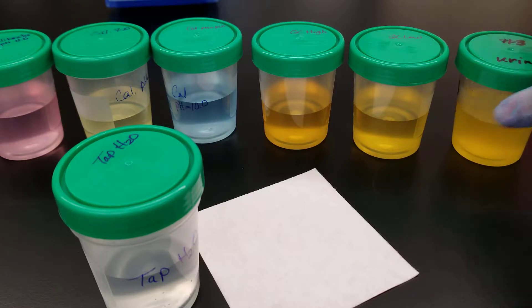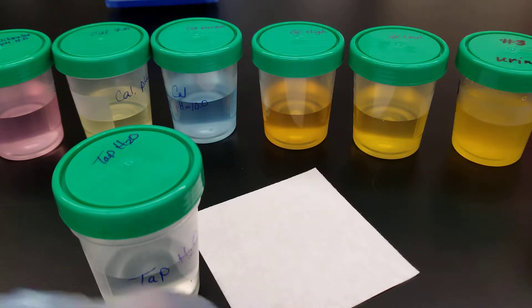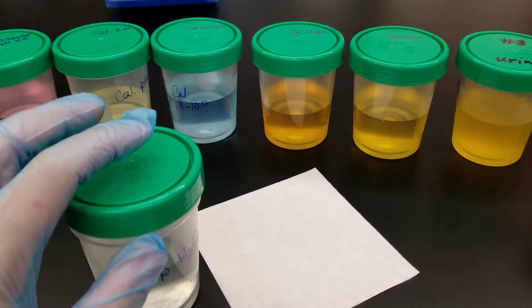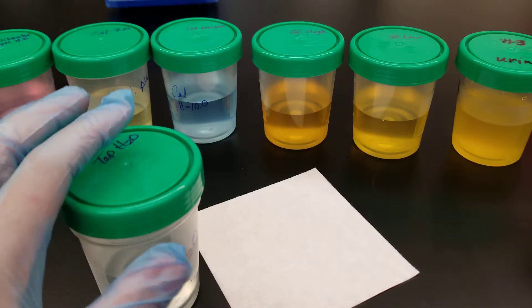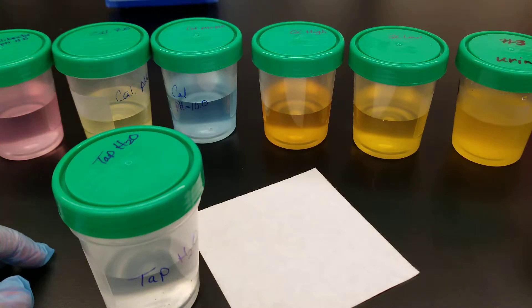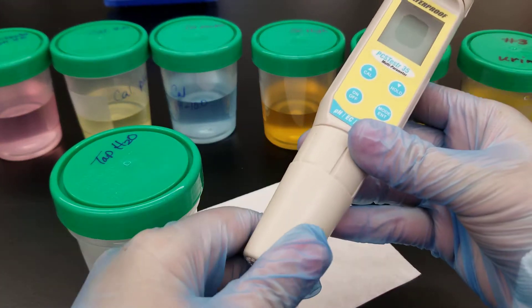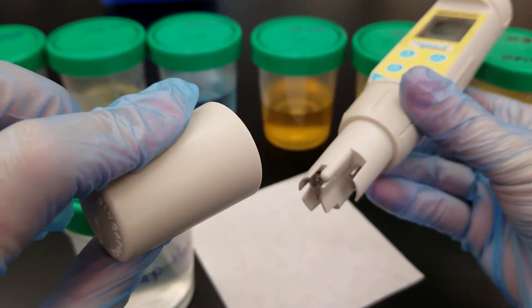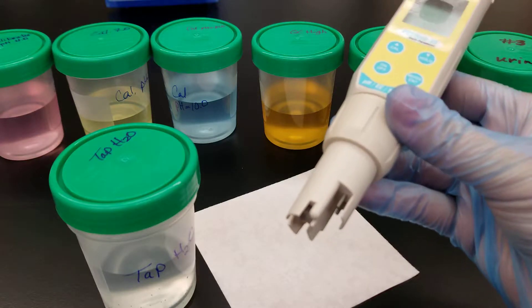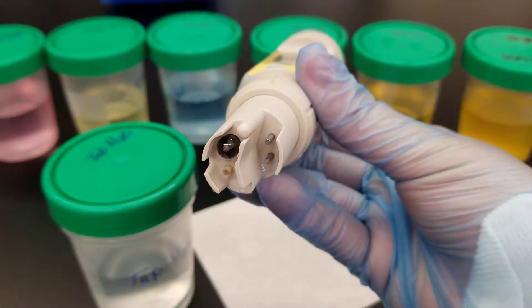In between each step, we're going to make sure to wipe the pH meter free of excess fluid, and then we're going to place it in the tap water just to rinse it, to make sure we don't have cross-contamination between each of the containers. The first thing you want to do is take the cap off the base. This is to make sure that the probe is protected, and you don't want to touch the probe.